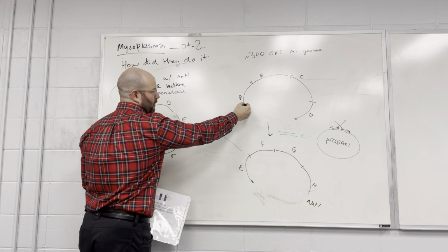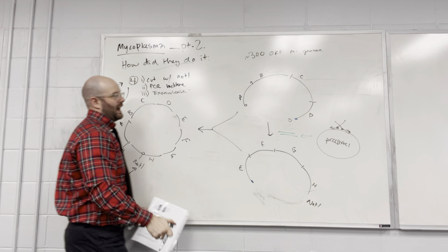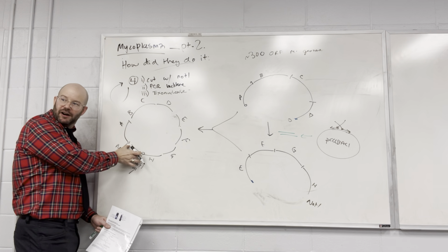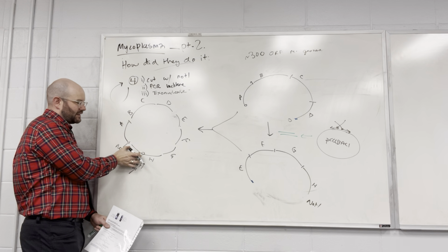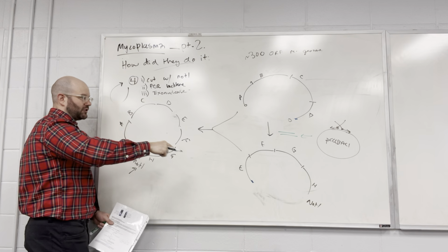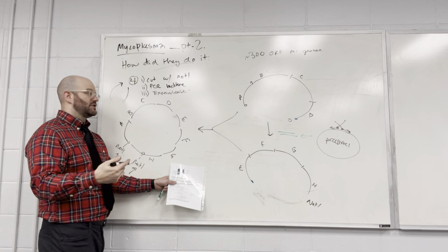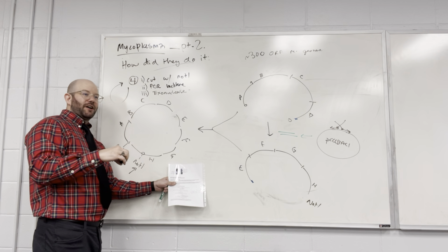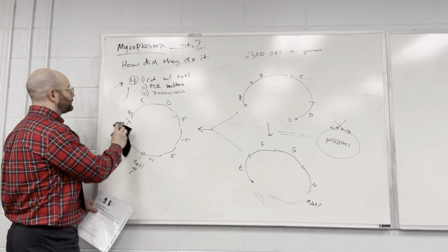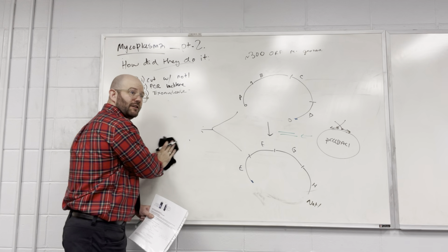Those sites that were originally on the ends have to get removed. They get removed, and then they add them back into those primers so that they're always coming back in right at the border of their larger construct. And so now they can just repeat this process to assemble larger and larger fragments. And they probably would have just kept doing this to assemble the entire genome, but what went wrong at some point? Once they got to trying to assemble the C and D parts, the D and E parts, they realized it was too large.